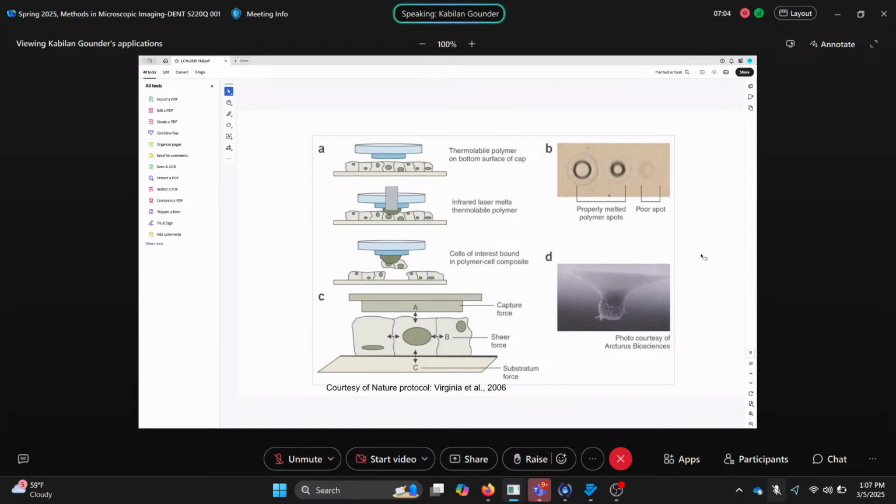So it's very simple, and as for the process, tissue samples are regularly processed the way we process samples for light microscopy and fluorescence microscopy, and we can do that as well. And then you can stain it.